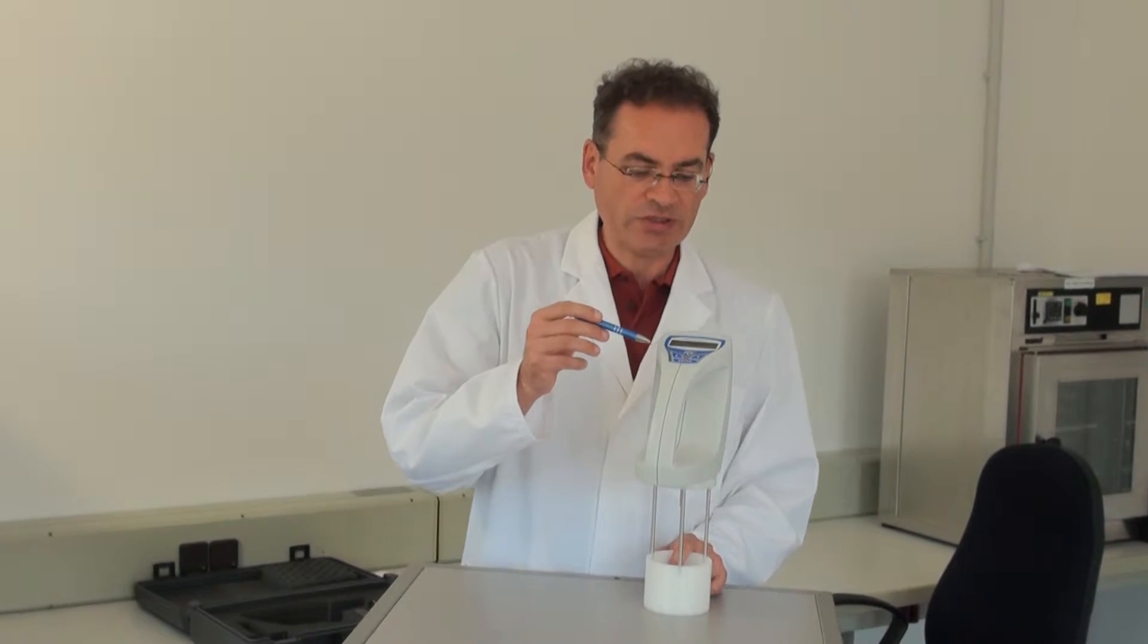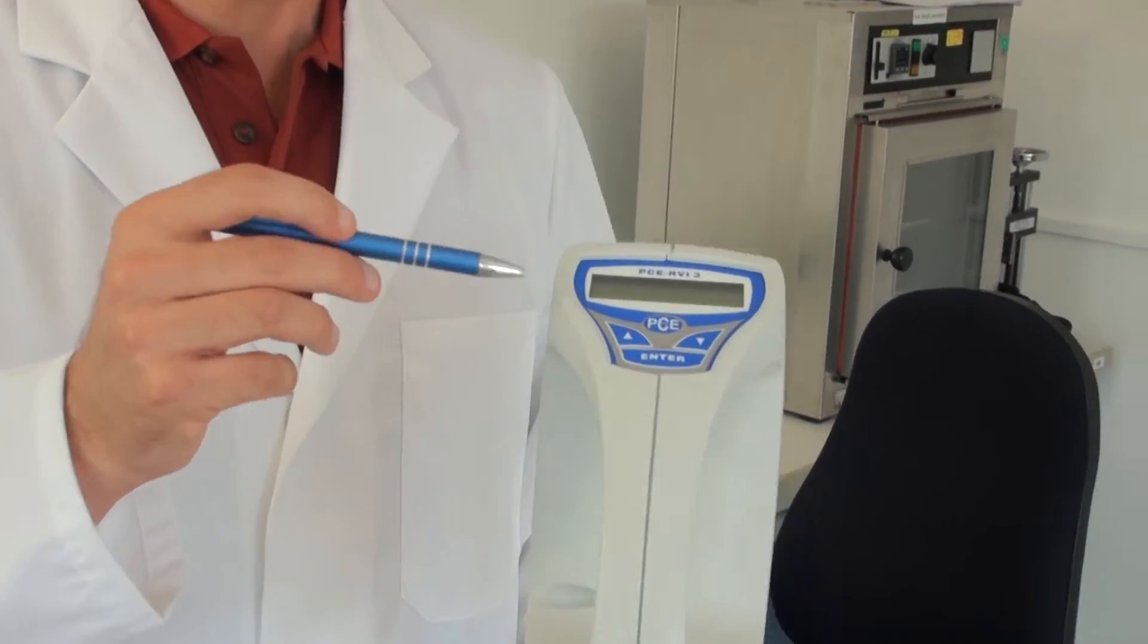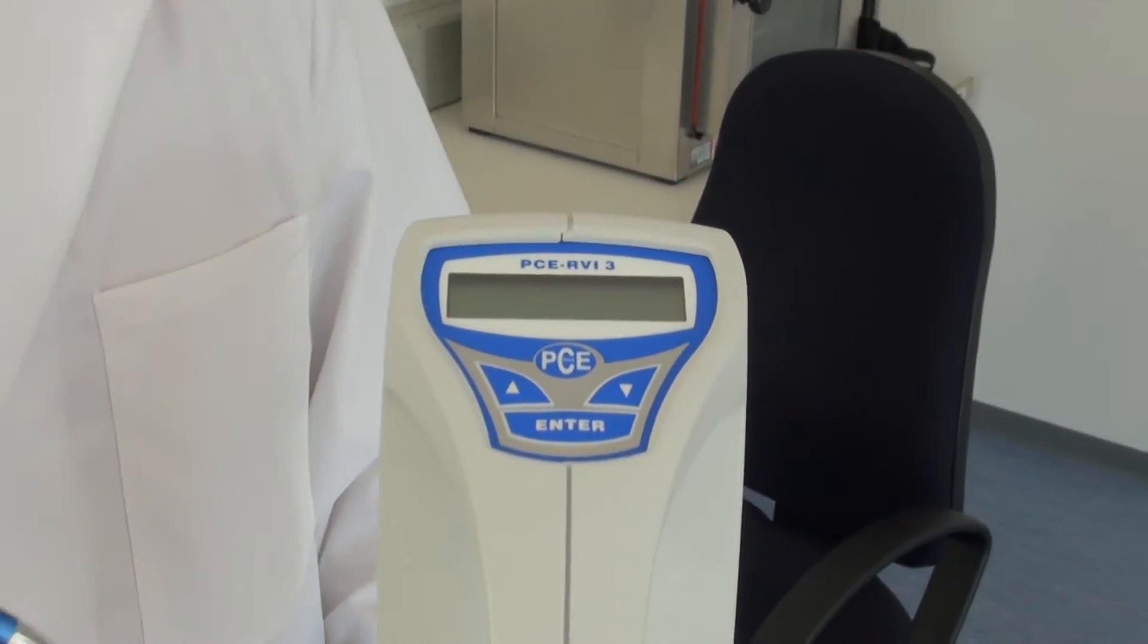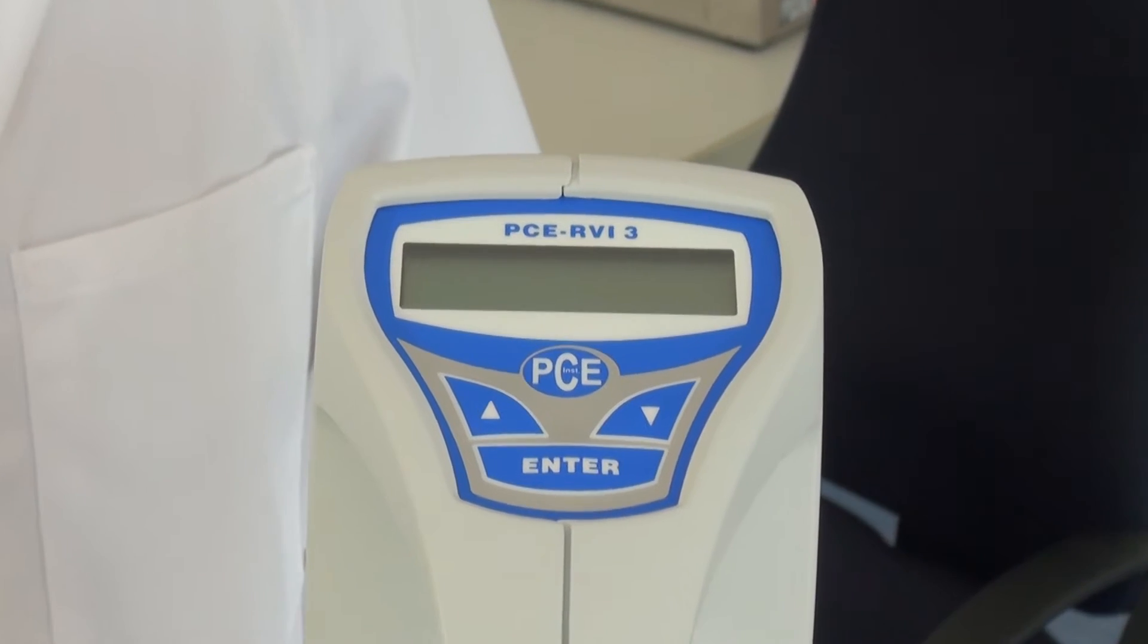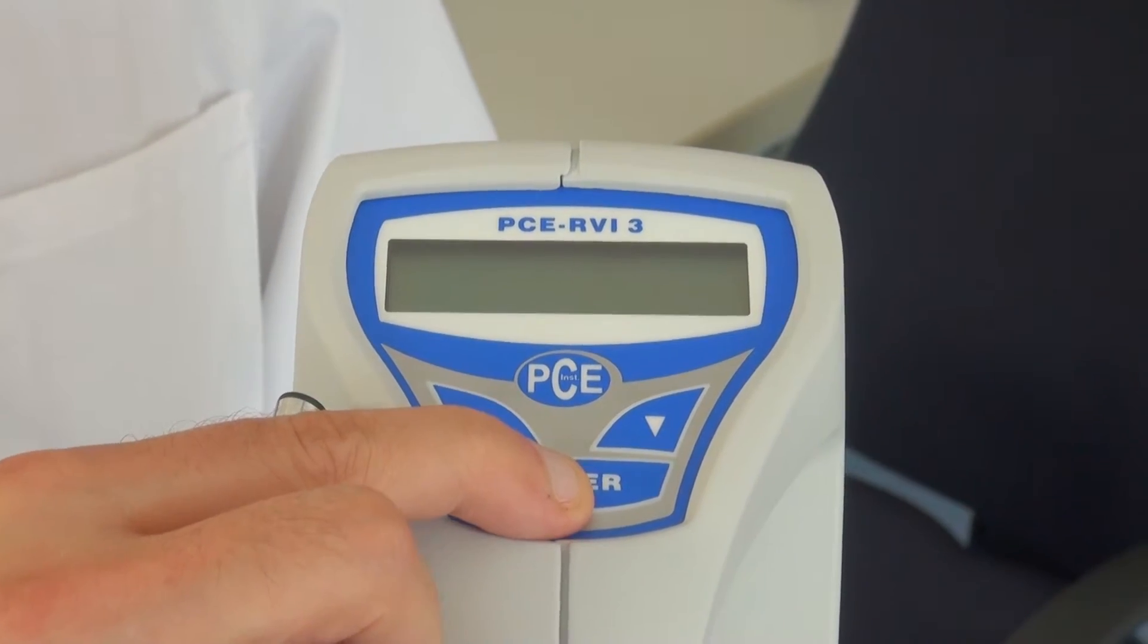The measuring device has on the top an operating panel and a display to show the measured value. The operating panel consists of only three keys and it is easy to use. To turn the device on, the enter key is held for about 10 seconds.